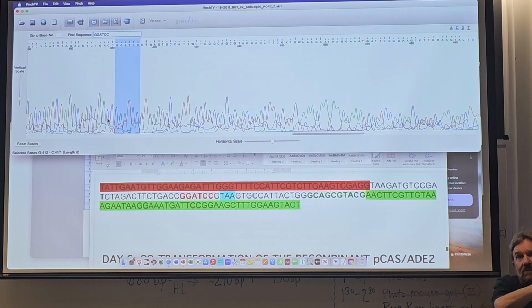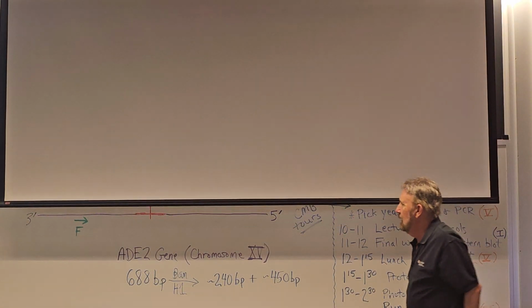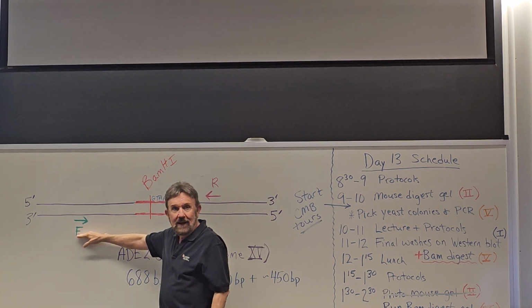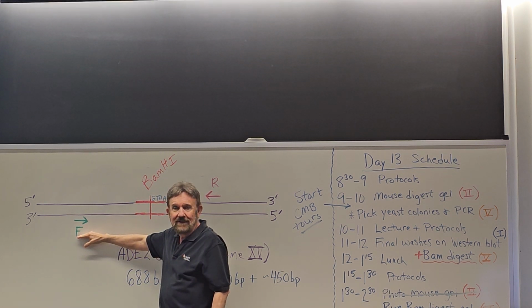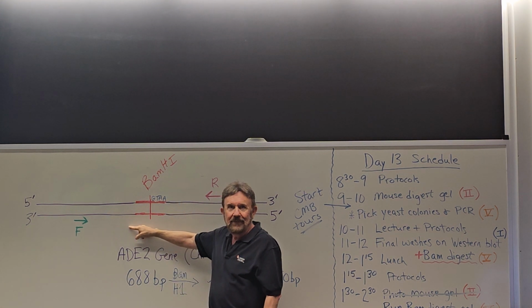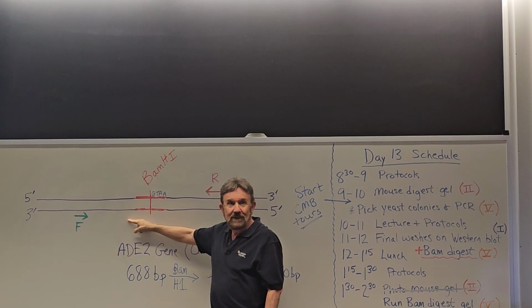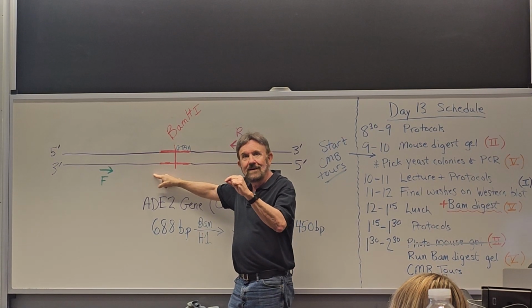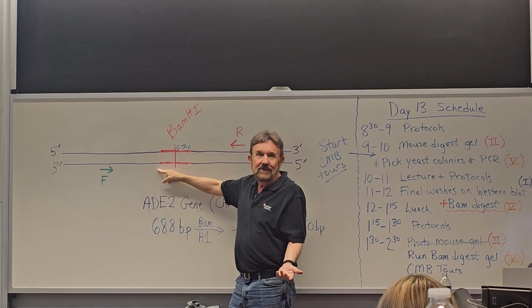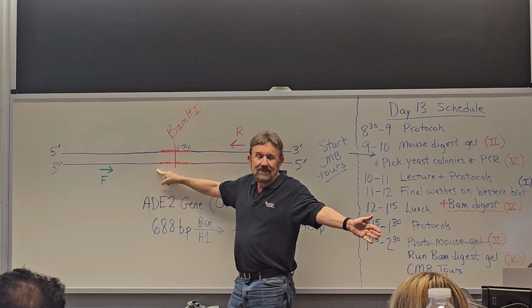We do PCR and get the product, and then we're going to read that product by hybridizing the forward primer. That's how we did the sequencing. And so when you start the sequencing, you're sequencing through these chromosomes. So whether you have successful CRISPR or not, this part of the sequence would be the same, right? So if you pick a non-CRISPR'd sequence and a CRISPR'd sequence, these first 300 some odd base pairs should have been the same, and that's where our sequence looks worse, actually. So I don't think that's it.